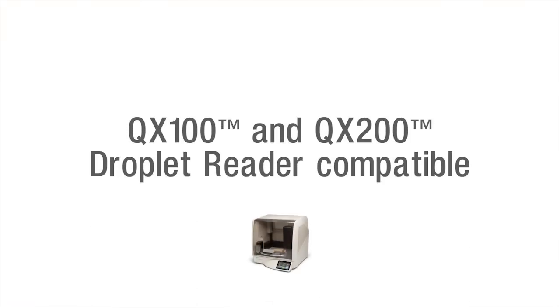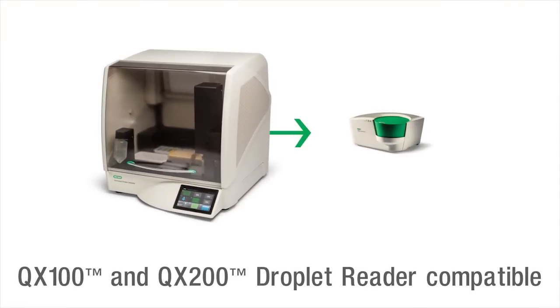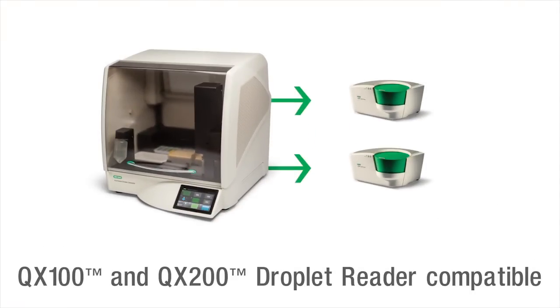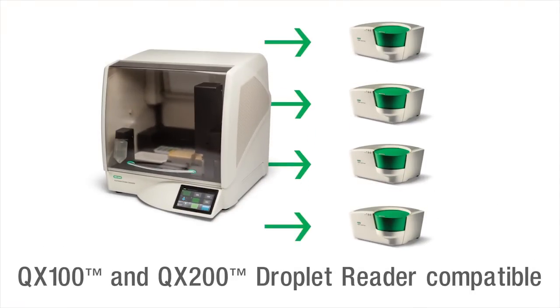A single automated droplet generator can make plates for multiple QX100 or QX200 droplet readers.